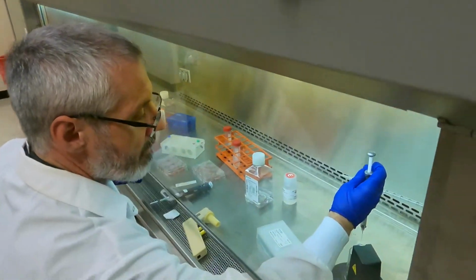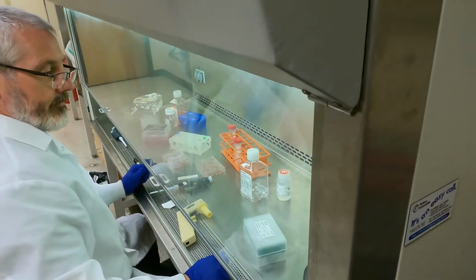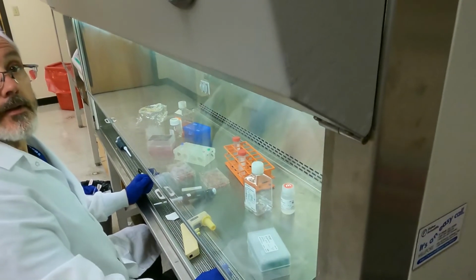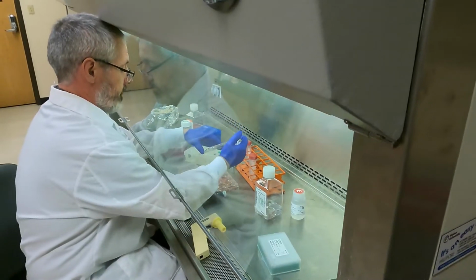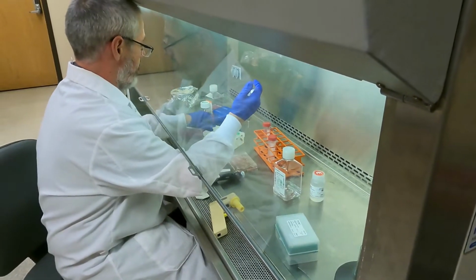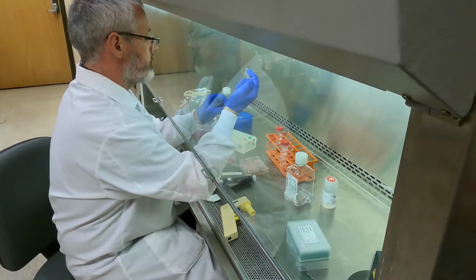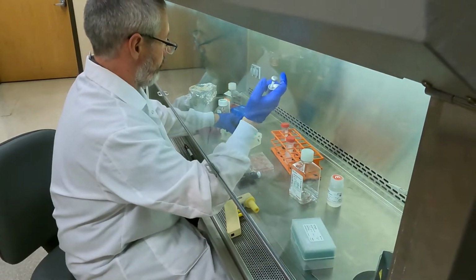Again. Shoot. See that? Yep. Good. We're doing good here. Now, at the very end here, what we're going to do is a DNA control, just to make sure that the whole thing works.